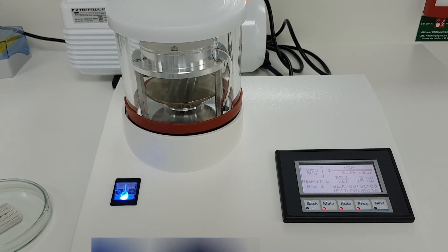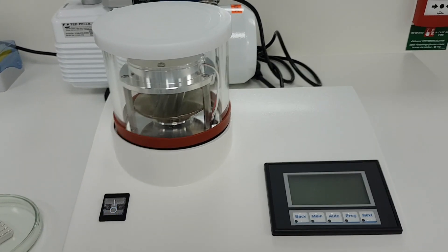Remember to turn off the system. This concludes Sample Preparation Part 1, Grid Glow Discharge. The next step in sample preparation is negative staining.